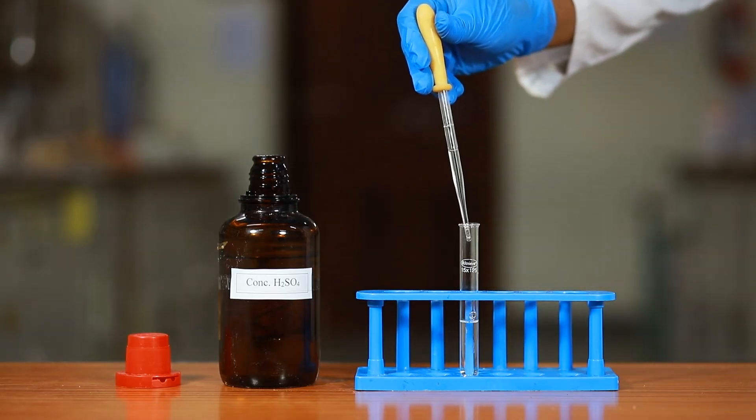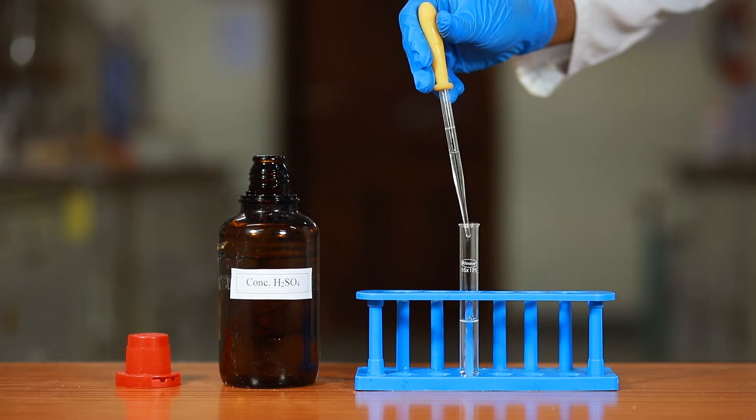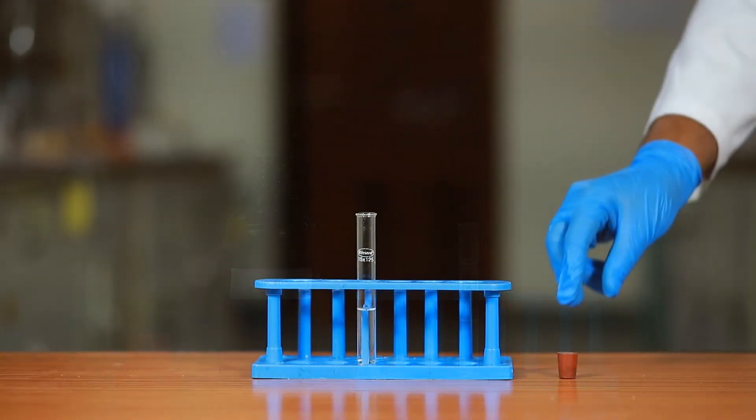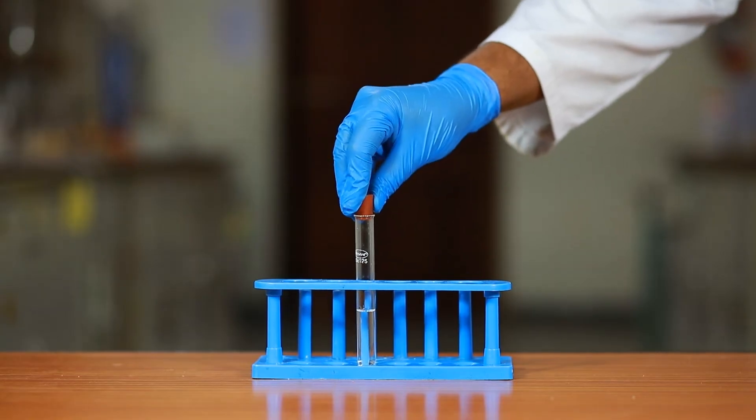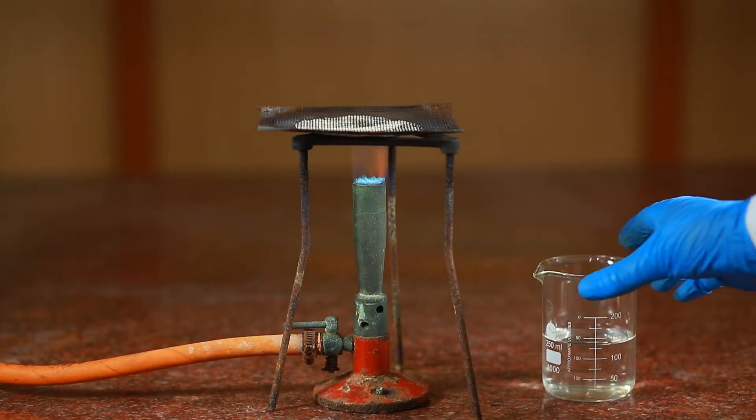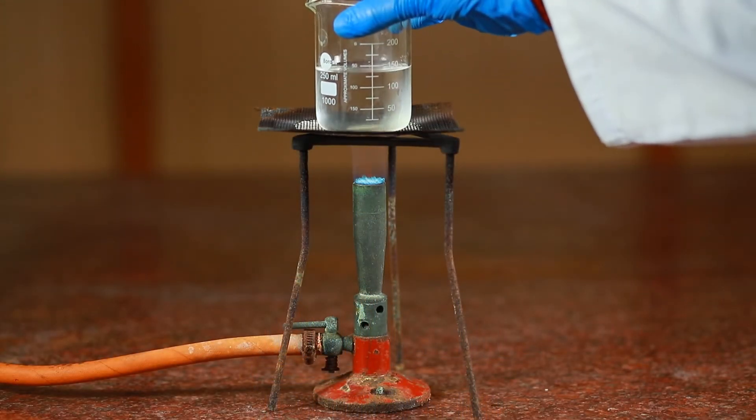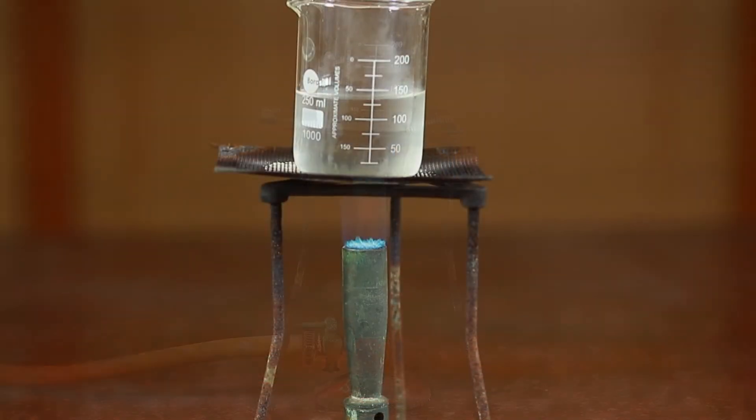Put a cork loosely over the mouth of the test tube. Take about 150 ml water in the beaker and heat it to about 60°C.